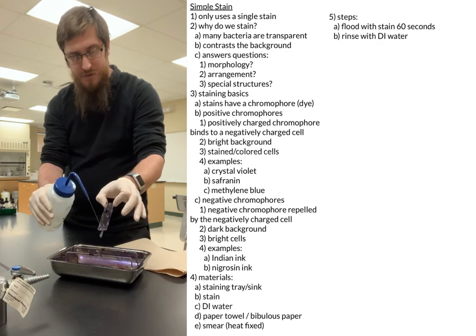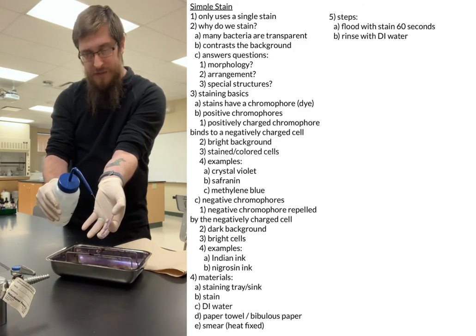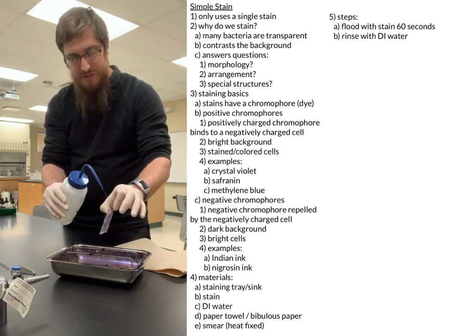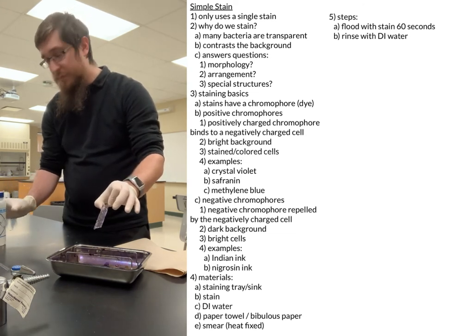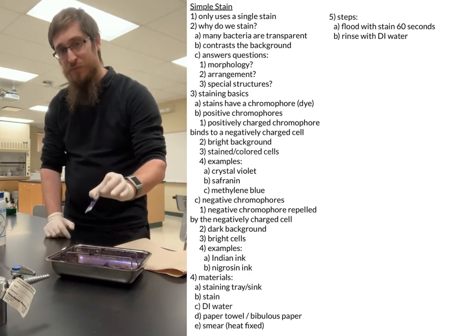Another thing that's good to do, you might have noticed that I cleaned the back as well. It's going to help a lot if you clean the back. It takes a lot of that background stain away, and it makes it easier to actually find what you're looking for when you look at it under the microscope. The biggest thing to note here, make sure you pay attention to which side is up and which side is down. It won't work if it's upside down when we do oil immersion.